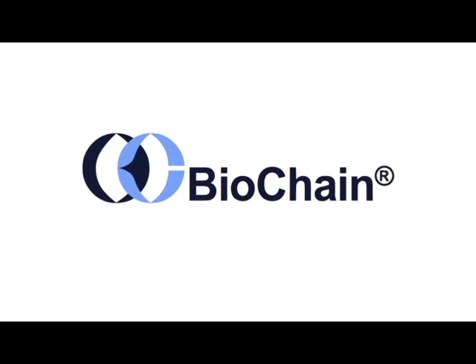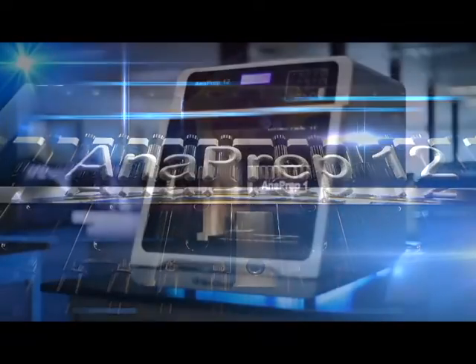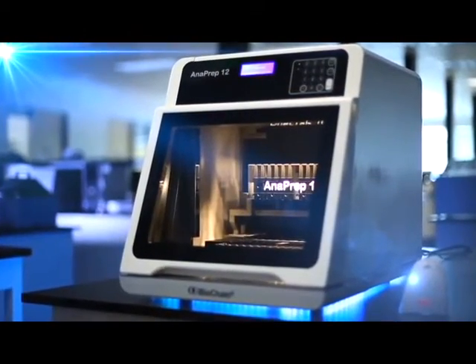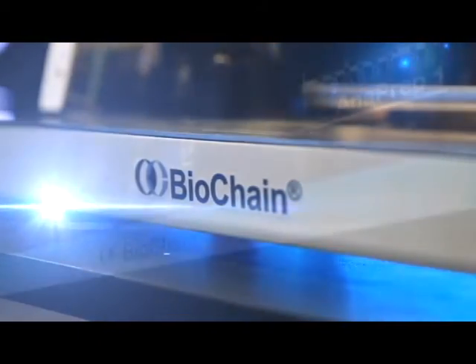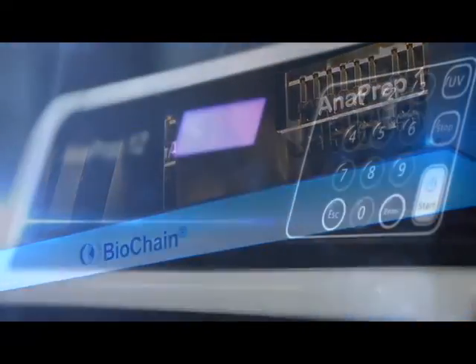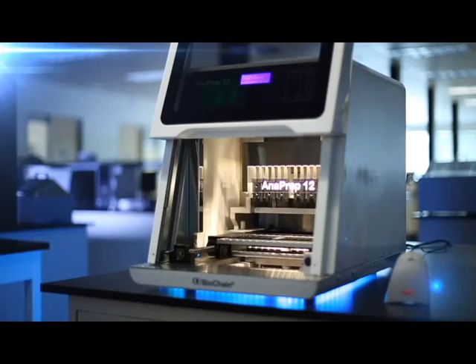DNA extraction and purification is now made a lot easier with Anaprep, a fully automated instrument launched by Biochain. Nucleic acids from a wide variety of biological samples can easily be extracted at high yield using the Anaprep system.